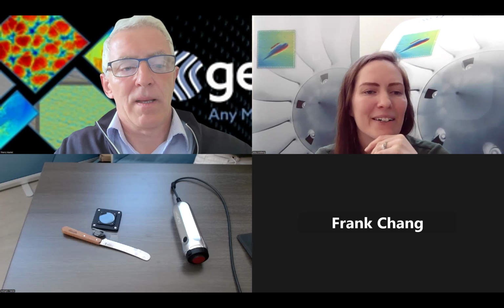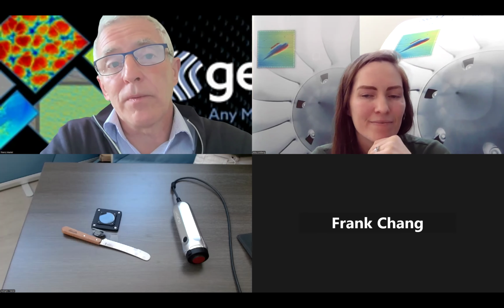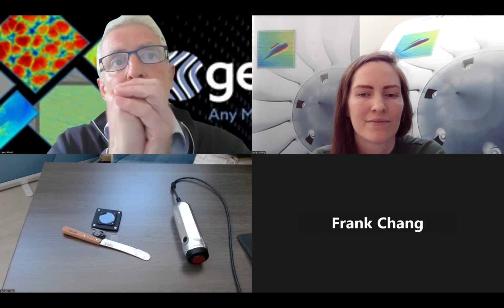Thierry, I don't know if you wanted to add anything to that. I know we have some people using the tool where we will still measure to what we can reach. So yeah, you clearly answered the question. We need to have contact between the gel and the surface to make an accurate measurement, and the aspect ratio needs to be greater than 1 when we consider the aspect ratio between the width and the depth of what you want to measure. Absolutely. It is the reason why during the introduction I mentioned that we are not able to measure, of course, the corrosion which creates galleries under the surface. Unfortunately, these types of corrosion we cannot have access to, and there is no easy solution to have access to them, for sure.